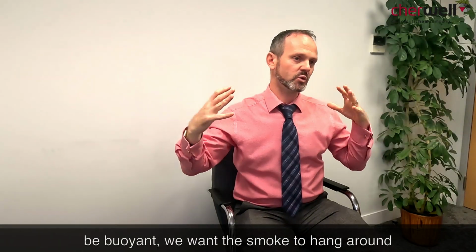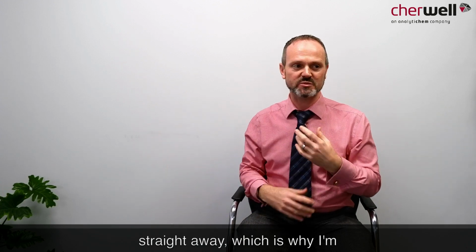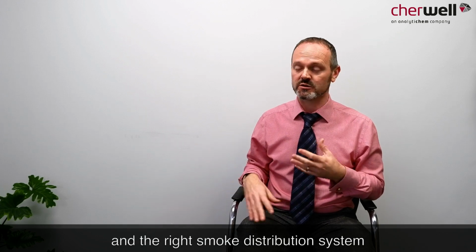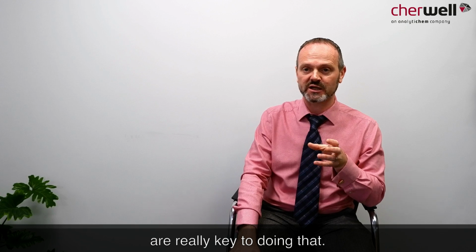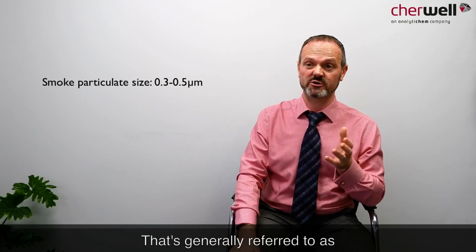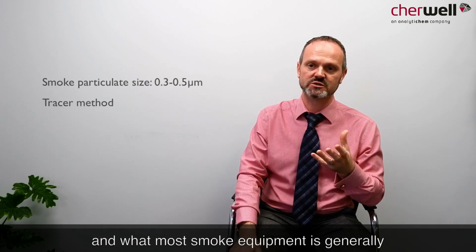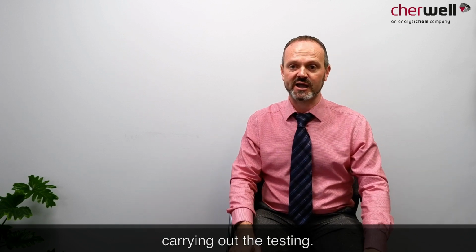We want it to be buoyant. We want the smoke to hang around for a while rather than dissipating straight away, which is why I'm saying that using the right equipment, the right materials and the right smoke distribution system are really key to doing that. So we're generally looking in the region of around 0.3 to 0.5 micron for our smoke particulate size. That's generally referred to as a tracer method, and it's what most smoke equipment is generally based on these days for actually carrying out the testing.